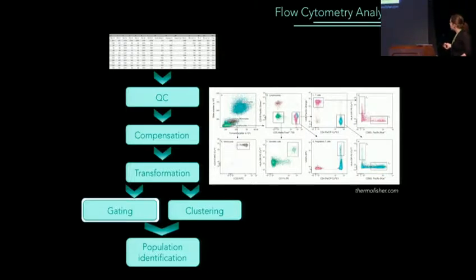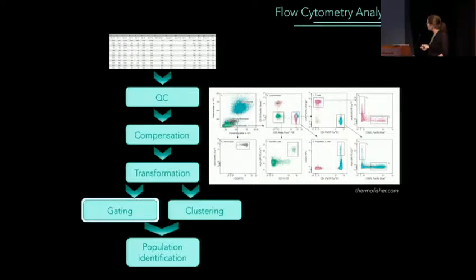And you're going to look in the CD19, CD3 dimensions, and you know that in that lower corner here, they don't express CD19, they don't express CD3. So you're going to look at those cells, and then you're going to look in another dimension. Here, are they expressing HLA-DR and CD11? And if they do express both of them, then you know that those are dendritic cells. So you can see it can become quite complicated and convoluted and hard on a grad student who does the work.